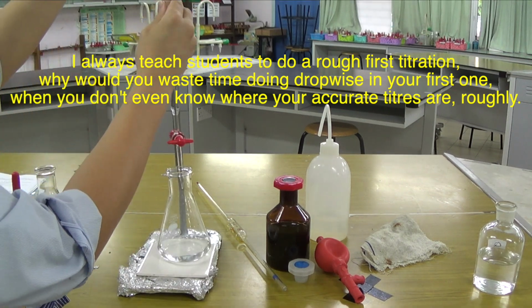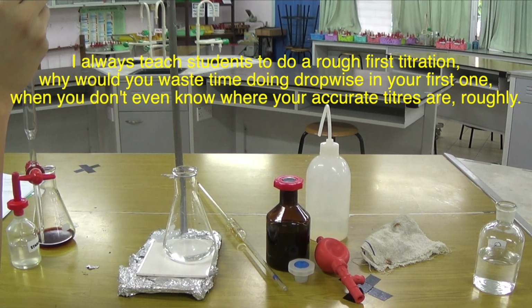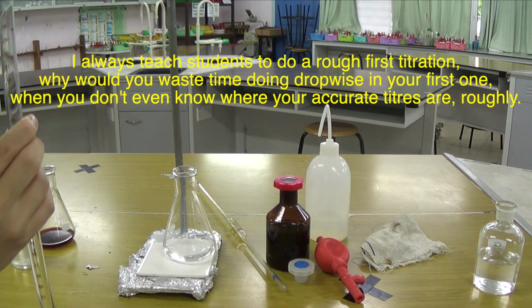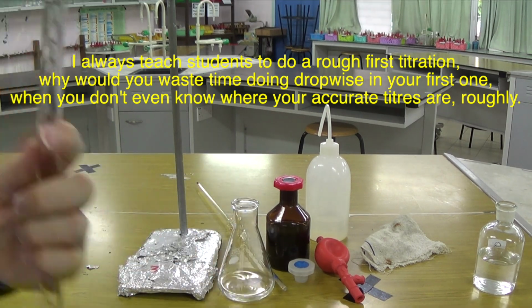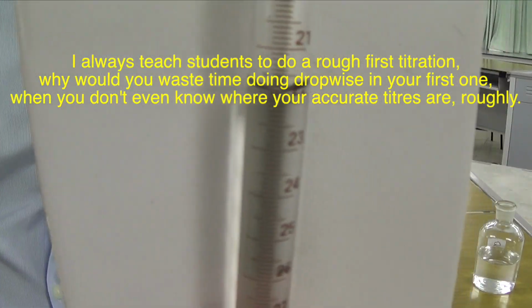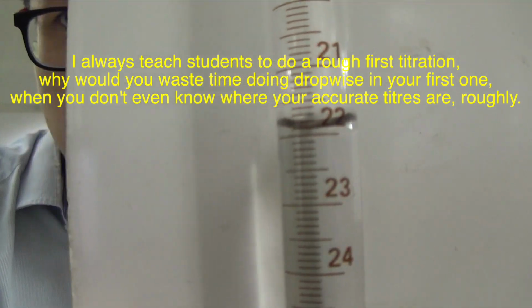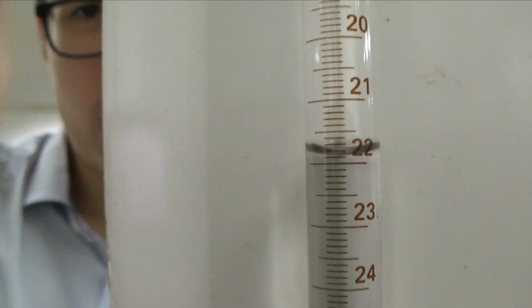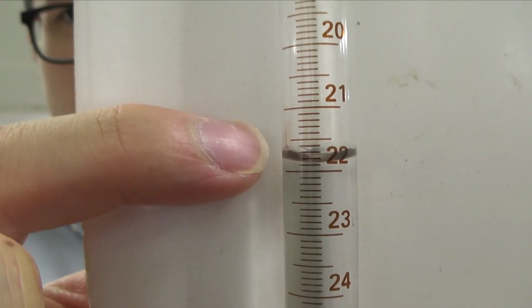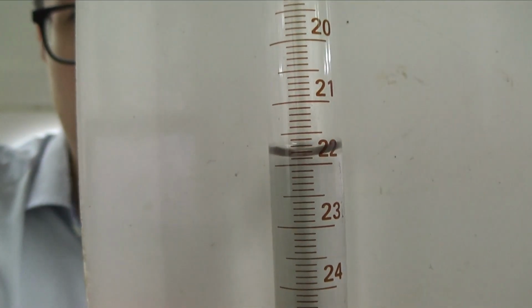I'm ready to read my reading now. This one is 21.9 cm cubed. If I just bring my white tile here, 21.9 cm cubed. Hopefully you can see that better. Let me just move that out a little bit. So 21.9 cm cubed, reading below the meniscus. You've got 21, 22, so you're reading downwards. So 21.1, 2, 3, and so on. The middle point is 21.5. So you've got 21.9 below the meniscus there.